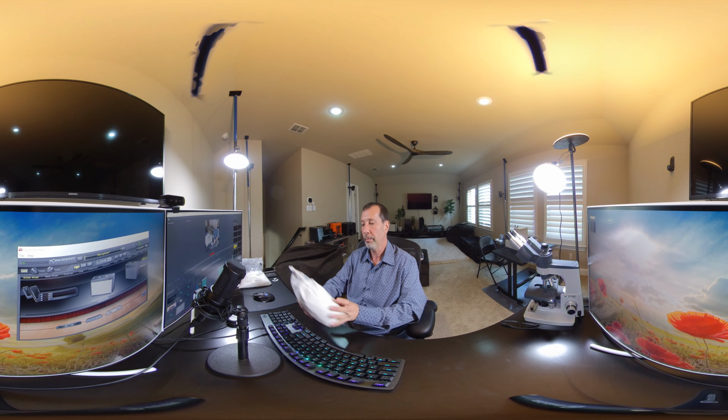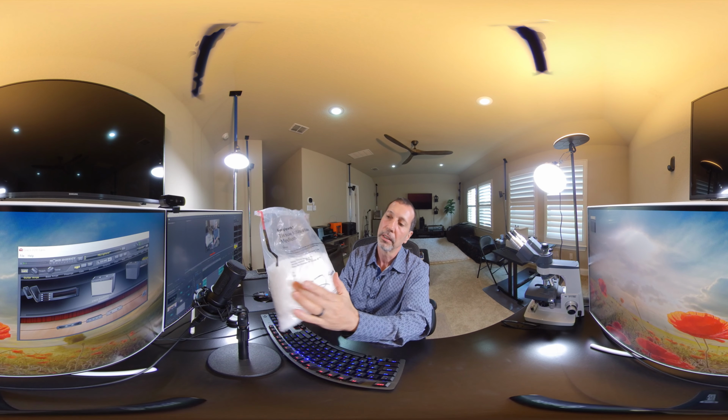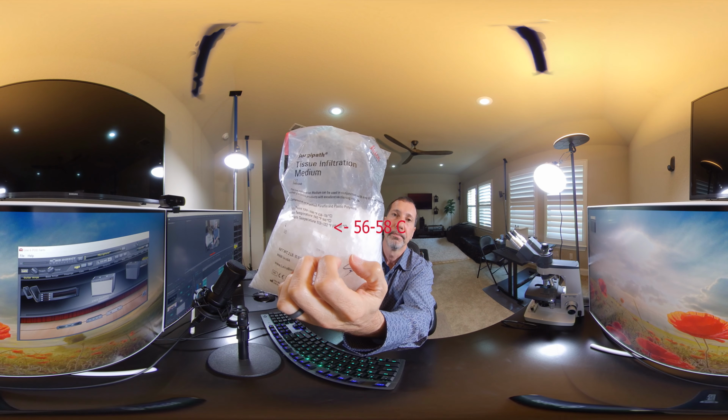So I wanted to show you a couple of brands of paraffin to give you an idea of what the bags look like and where to find the melting points on them. Here's a McCormick brand, and they have a melting point which is located here at 52 degrees Celsius. Let me see, right there. Here's a Leica brand, and they have a range of 56 to 58 degrees Celsius, and you can find it right there.